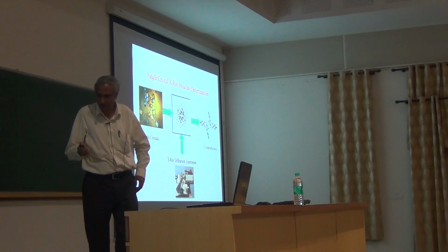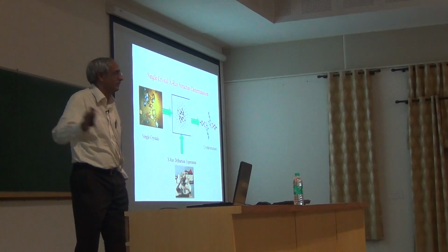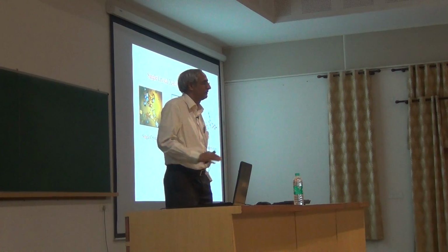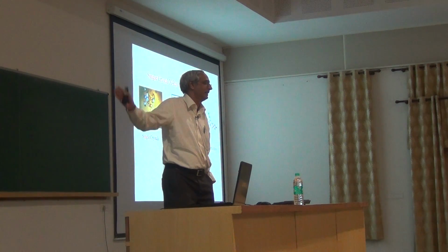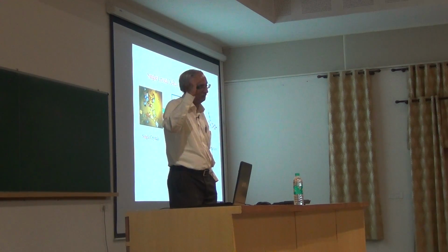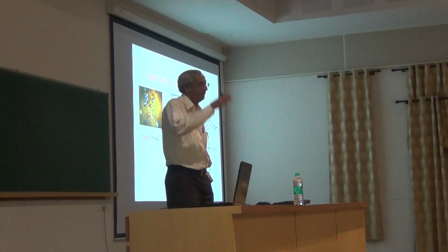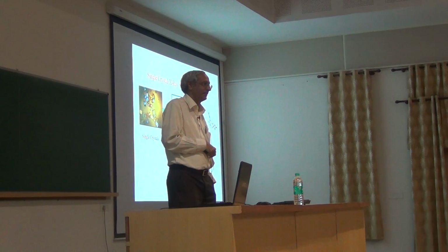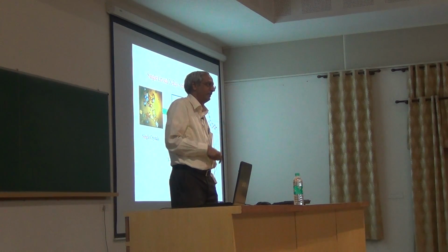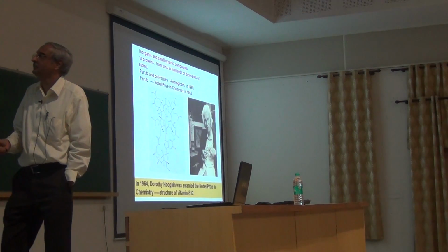And we can actually look at what happens to an atom when it becomes a part of a molecule, and what happens to a molecule when it is put in a crystal lattice in enormously more detail, because what we plot here from an X-ray diffraction experiment is the electron density. So we can look at electron densities involved in bonds, involved in hydrogen bonds, involved in halogen bonds, and all kinds of many weak interactions. We can even draw a thin line between van der Waals interactions and weak hydrogen bonds. So these are some of the achievements which came through.